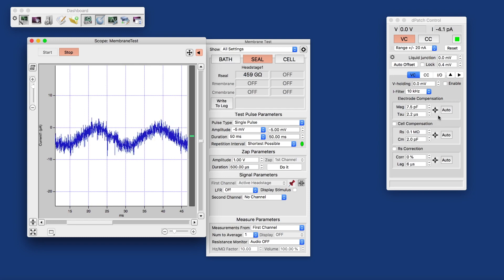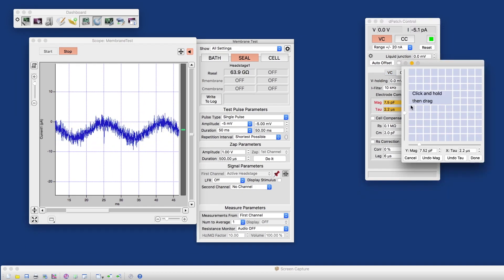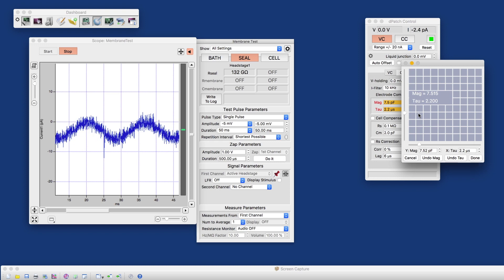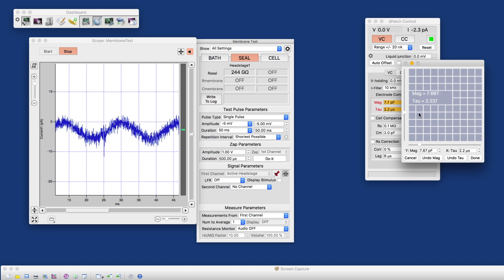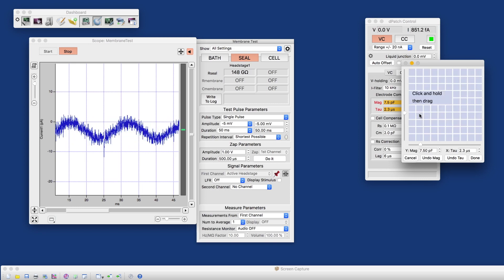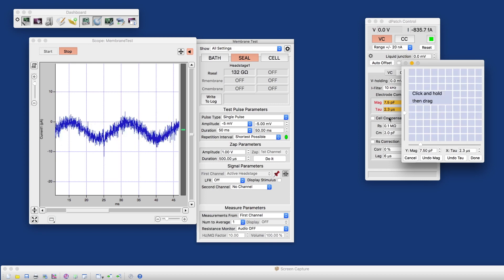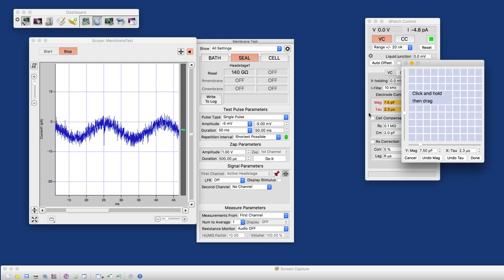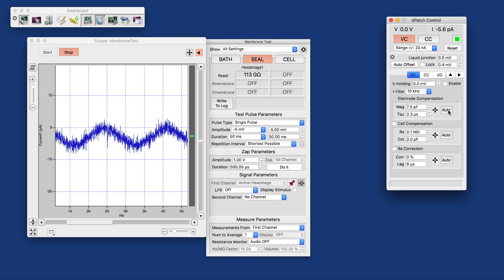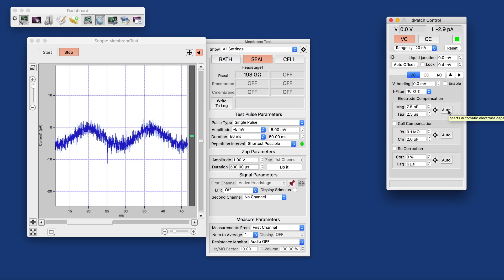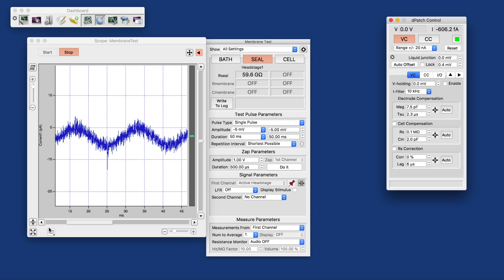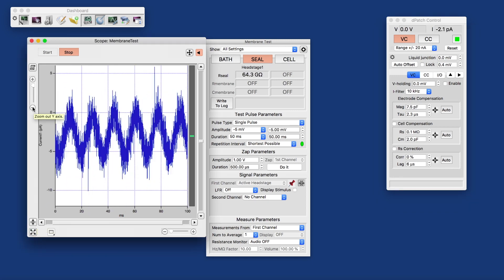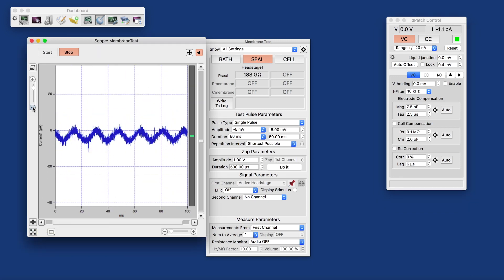And what we could try is using the two-dimensional matrix here to compensate for the mag and the tau and touch that up a little better. Ideally, the auto compensation should have done a reasonably good job. What we probably also want to do now, first I want to auto scale here and actually zoom out a couple more times.